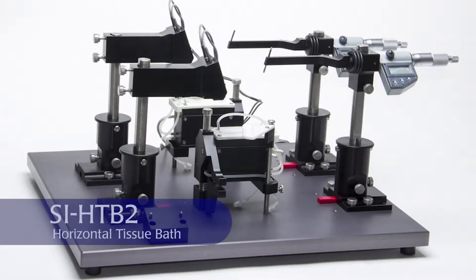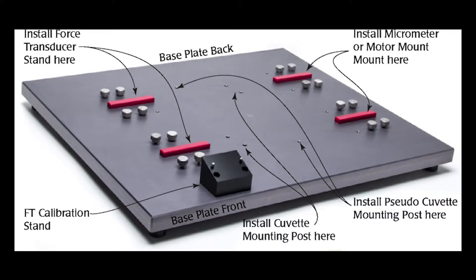Before setting up the horizontal tissue bath, carefully unwrap each piece before beginning. The base plate is heavy, so assembly requires two people. Do not set this equipment up by yourself.